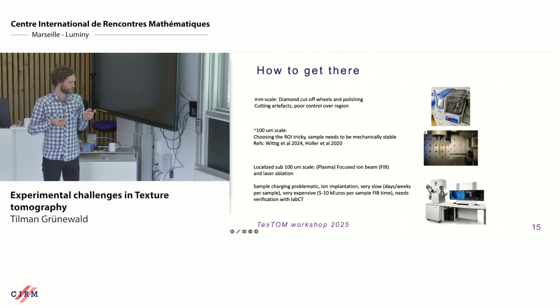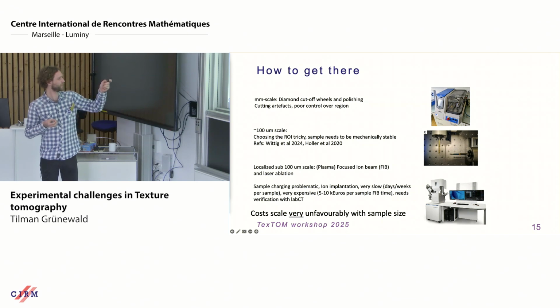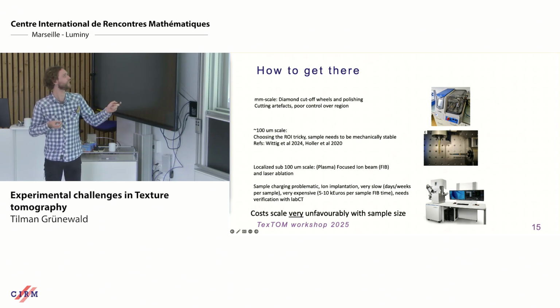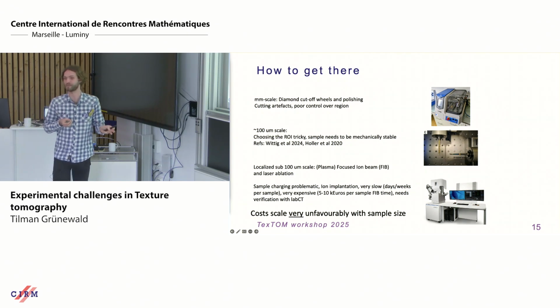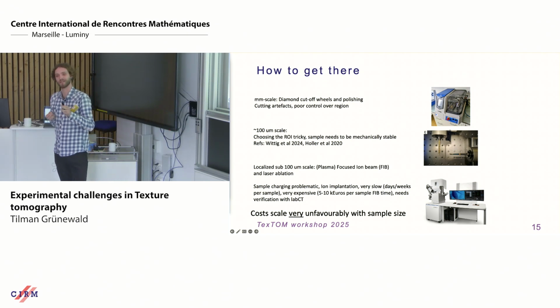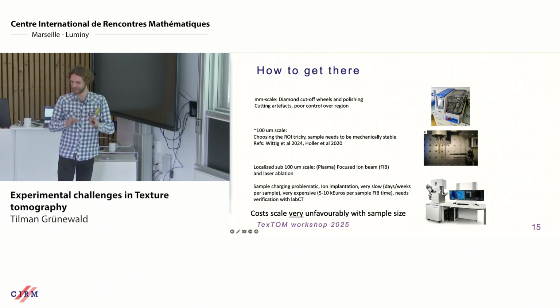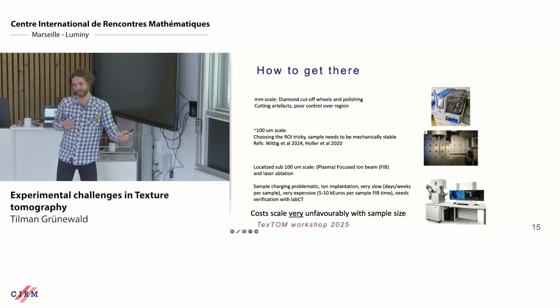I mean, that's my takeaway message for this slide, that it's a pyramid of pain. Here this is something you can do in an afternoon. This is something you can do in a couple of days. This takes weeks. I mean, we had an experiment with my PhD student Momo, where I think we spent 3 months on 4 samples. And you don't want to know how much money we spent on this. It was worth it in the end, but cost scales very unfavorably with the size.